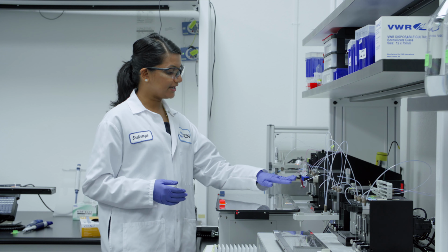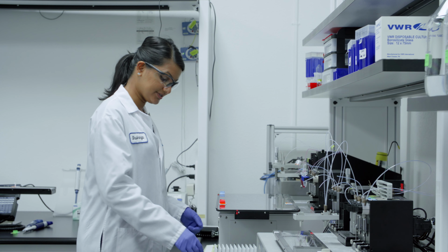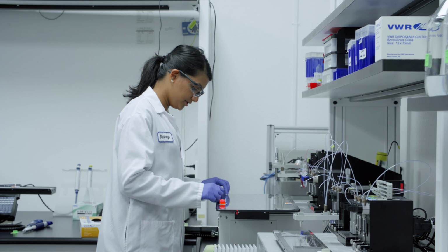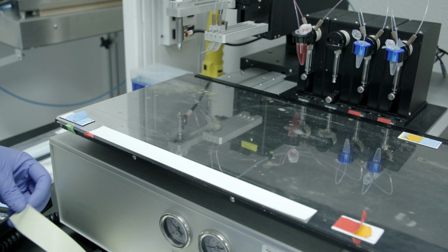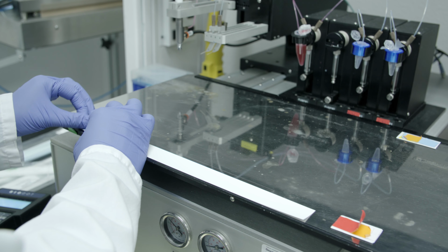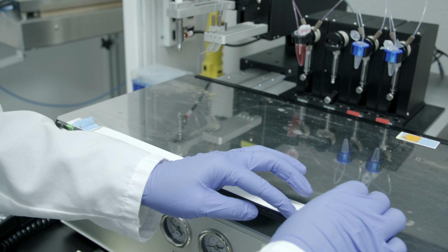Once you have them prepared in the solutions, you can then dispense it onto nitrocellulose that we have here. And this is how you get the 2 lines. So I'm going to place my membrane, make sure it's flush to the bottom so that my positioning of the lines is the same from membrane to membrane.